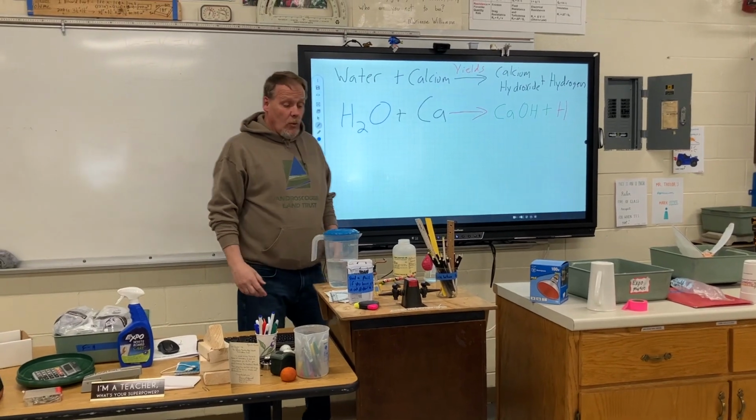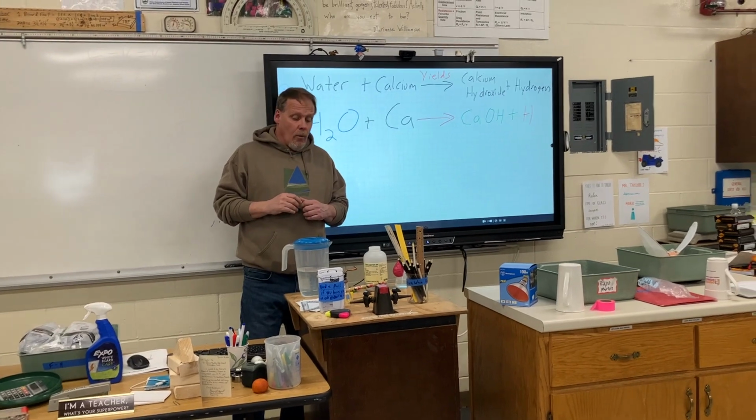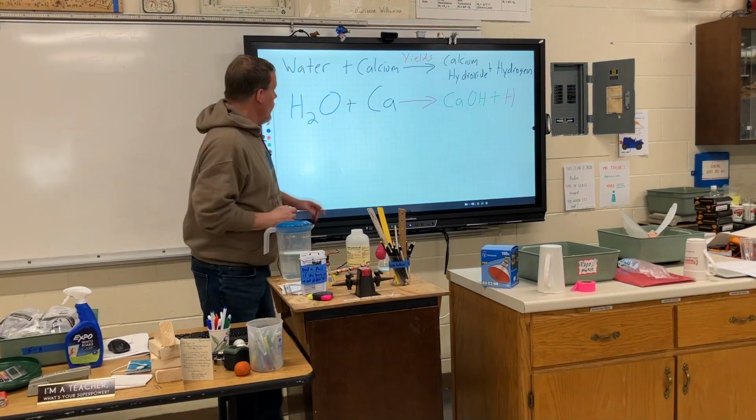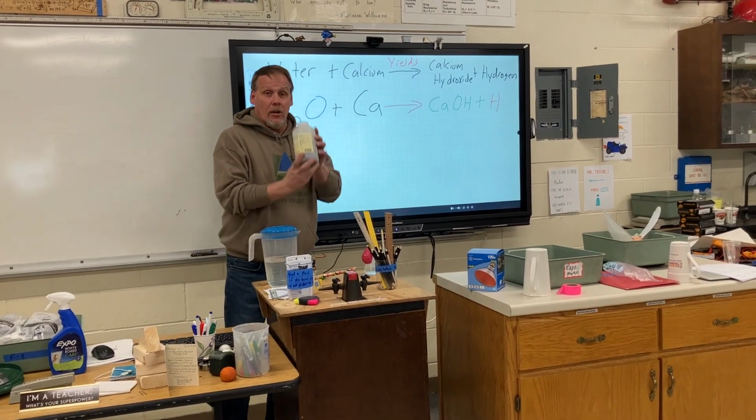So today we are going to do a reaction to produce hydrogen gas. And what we're going to do is we're going to start off with some water and some calcium metal.